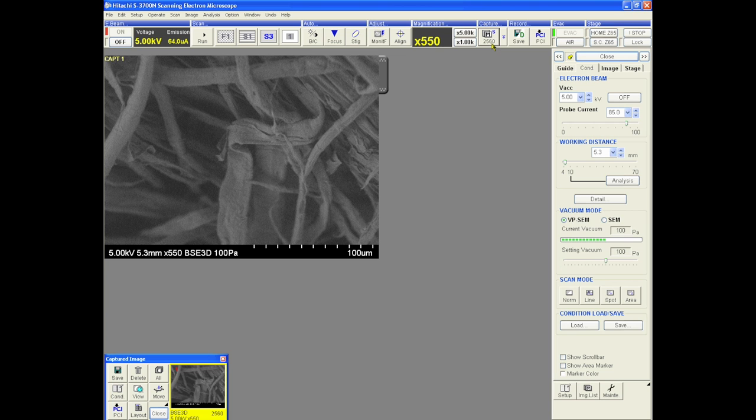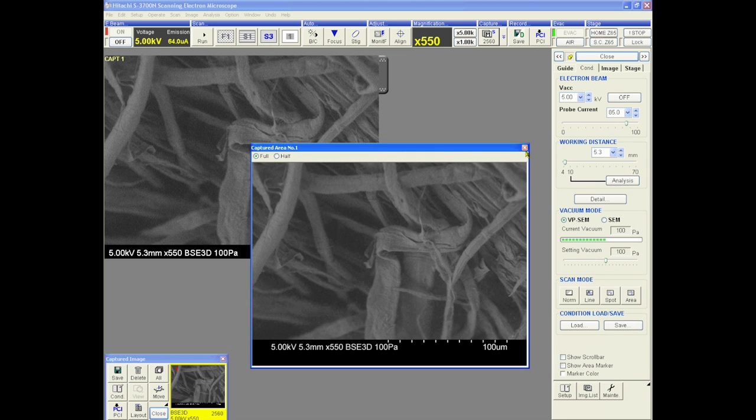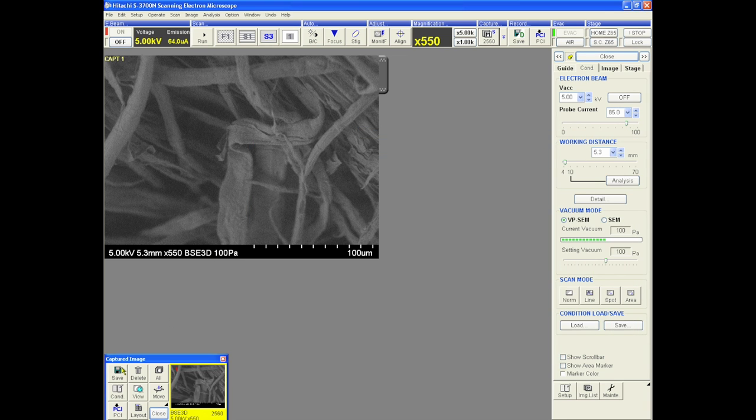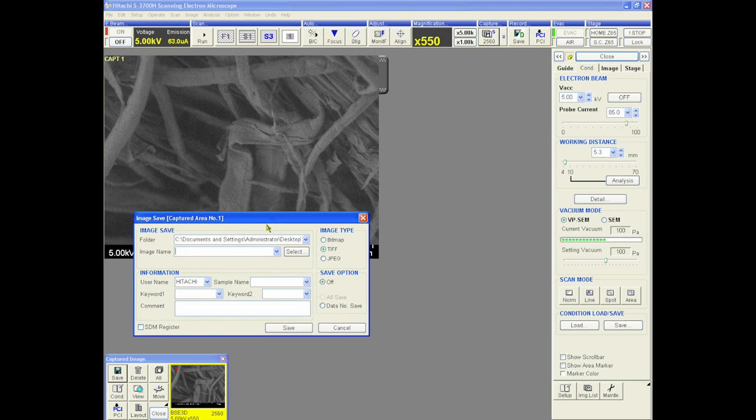Use the capture button to acquire an image. Once an image is acquired, it can be saved and exported to a post-imaging analysis software. The PCI software allows image manipulation and measurement among other capabilities. For the full instructions on these features, please refer to the manual.